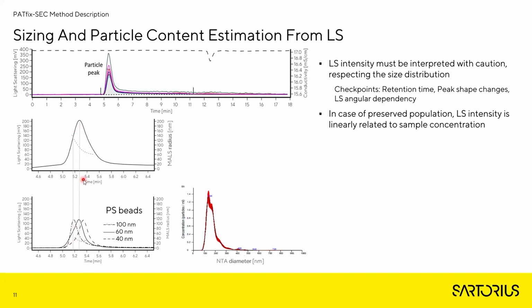However, for more precise analysis, it's better to use multi-angle light scattering and actually assess the angular dependency of the signals.